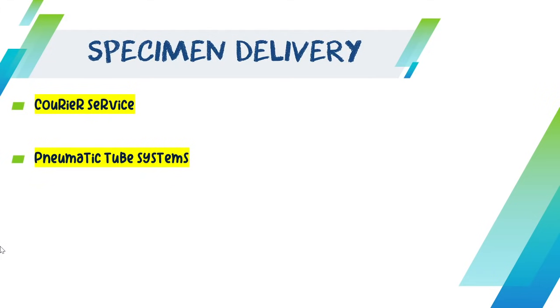Next is your pneumatic tube systems. Now, pneumatic tube, I guess you might have noticed if you have been to SPMC and Davao Doctors. But so far, from what I have heard, the pneumatic tube system is not really used in SPMC and Davao Doctors, because somehow when we look at it, there are problems or disadvantages with the use of pneumatic tube systems, and that is what I will present.